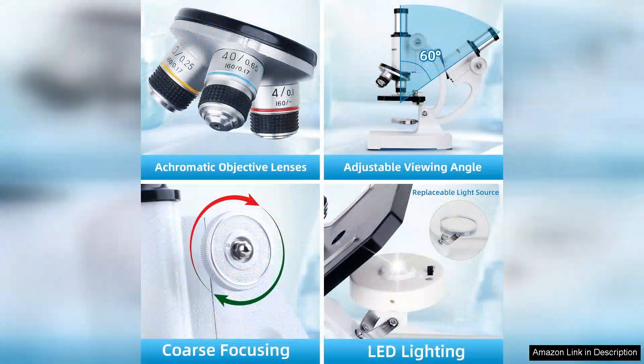The inclusion of prepared slides is a fantastic feature for novice users. They can start their journey right away without the hassle of preparing their own samples, ensuring that kids stay motivated and excited about their findings.